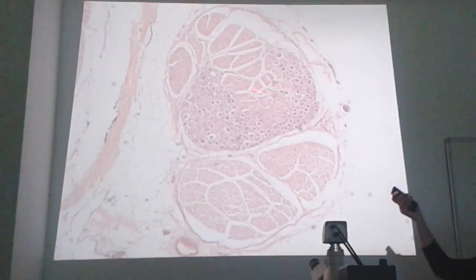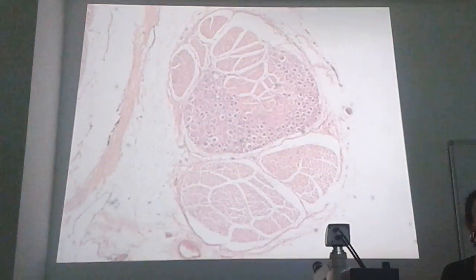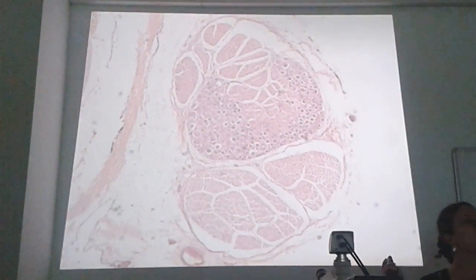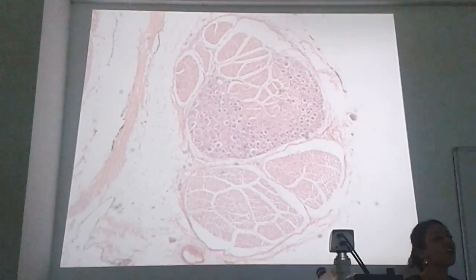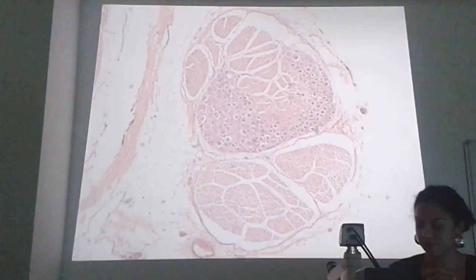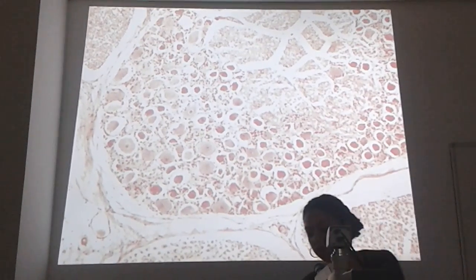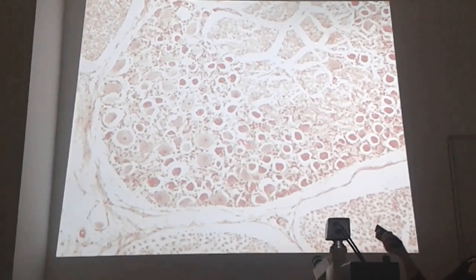Okay. So what's the specialty of dorsal root ganglia? What is it? What type of cells are these? Pseudo-unipolar. Okay, why is it pseudo-unipolar? What does that mean? Okay, these are ganglia, alright?